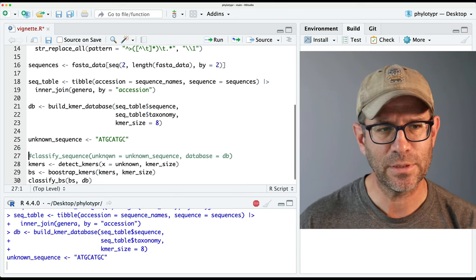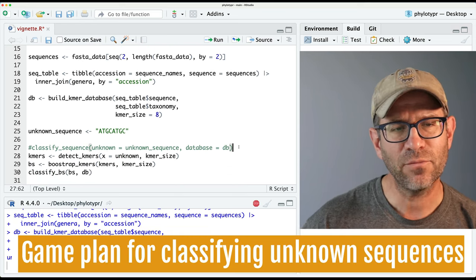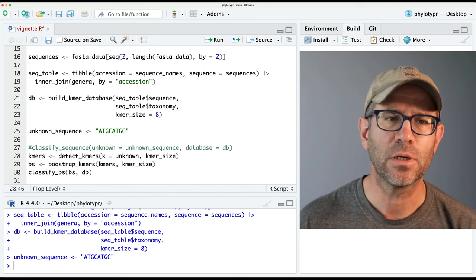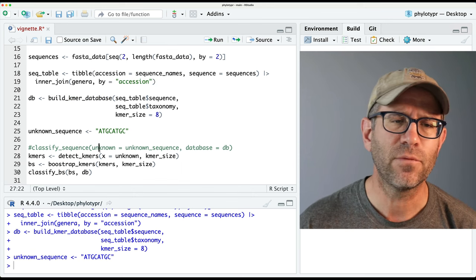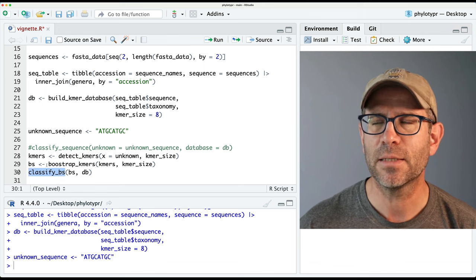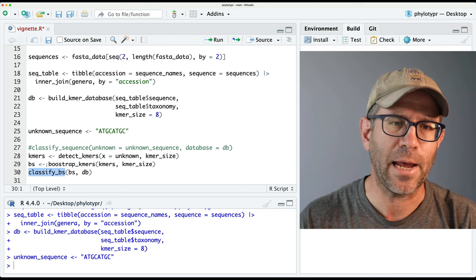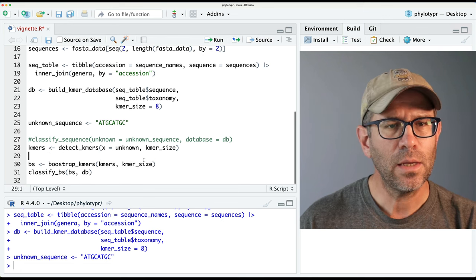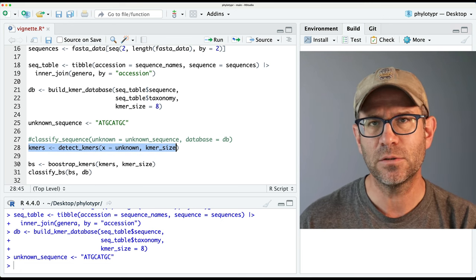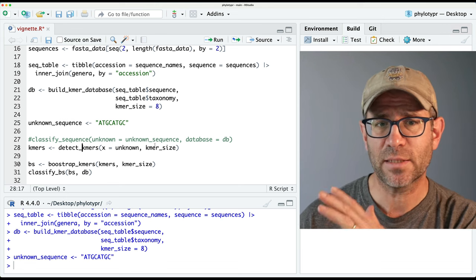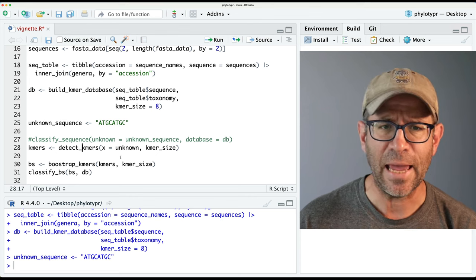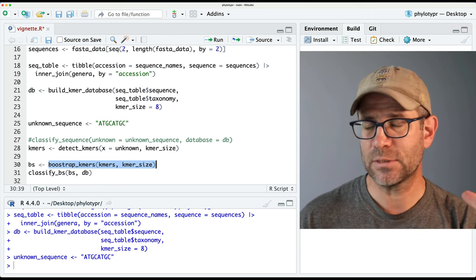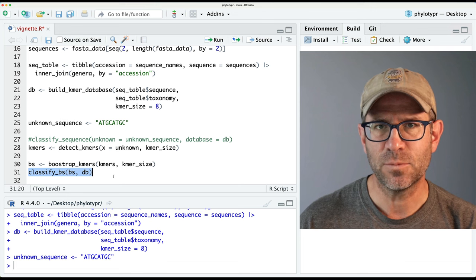We have our unknown sequence which we're using to test things out. What we have now is our classify_sequences function — this is kind of a prototype of what we want to be a user-facing function. build_kmer_database is also a user-facing function, but things like detect_kmers, bootstrap_kmers, and classify_bs are going to be internal to the workings of the package — we don't want our users to be using or touching those directly. So we have our k-mers, we can take this unknown sequence, detect_kmers converts it to base 4, and then extracts all the k-mers of a k-mer size — the default is eight in our package.